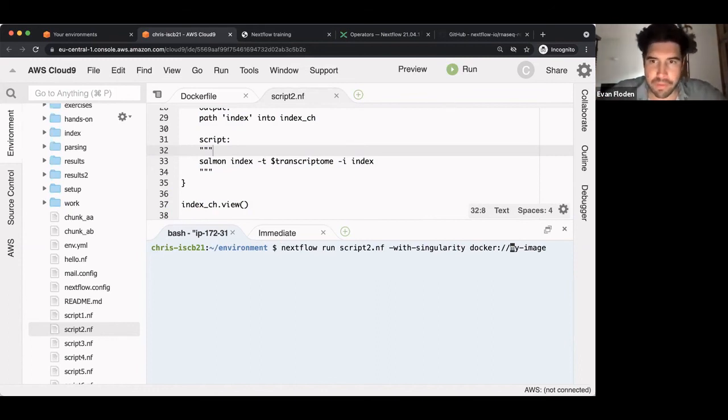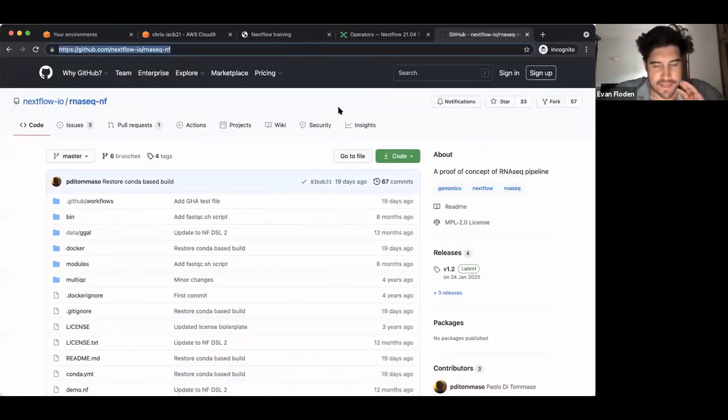Another thing that you can do, going back to the pipeline that we had before because it's a nice example of this, is that we can leverage Conda here. Conda is a fantastic resource for so many of the tools. There are something like 7,000 bioinformatics tools, at least inside of Conda. So we typically want the best of Conda in the sense that it's got this fantastic repository of tools which are really easy to install.